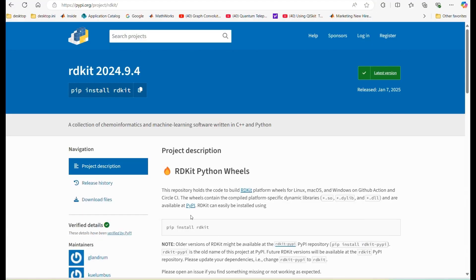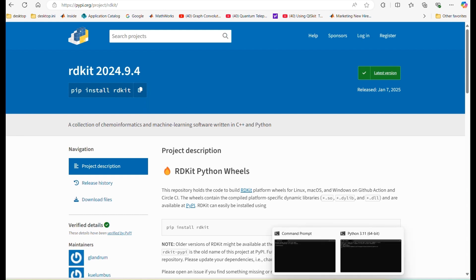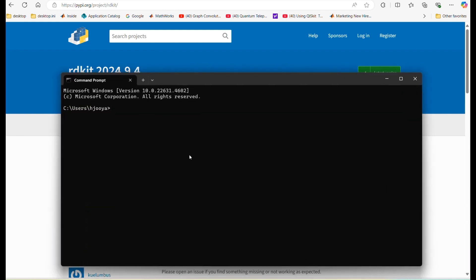Installing Python libraries is our next requirement. We will install RDKit, which is a cheminformatics package. Simply copy this command and run it in your command prompt to install RDKit. With these steps completed, you are all set to run this example.